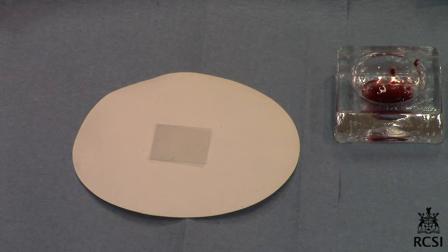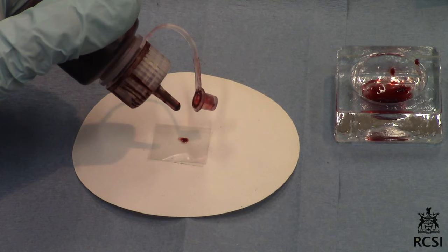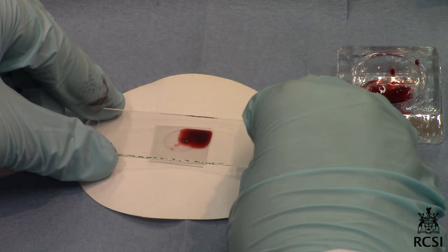Transfer the tissue to a cover slip standing on 2-3 thicknesses of filter paper. Add one drop of fresh stain. Gently place a clean glass slide over the cover slip.